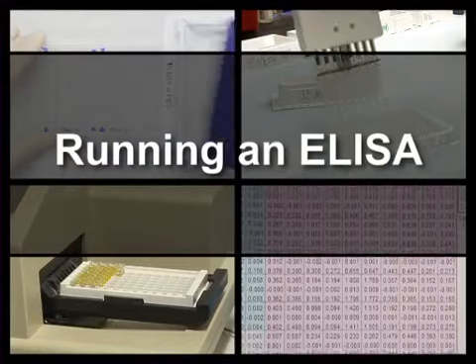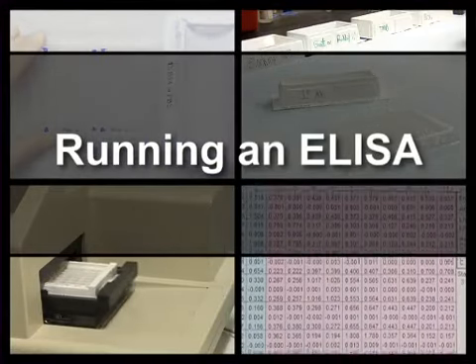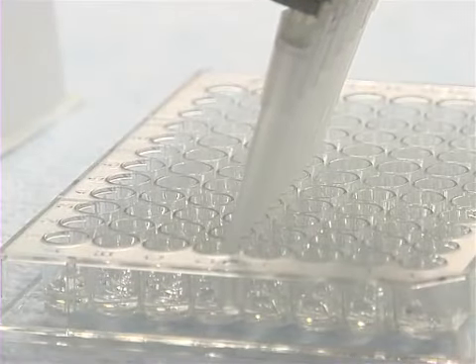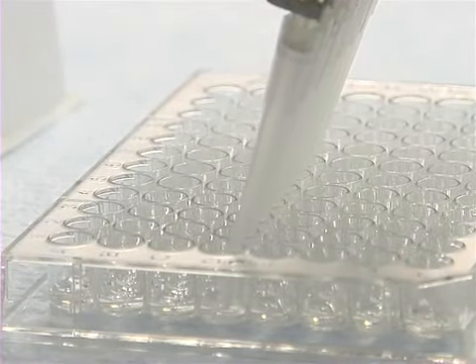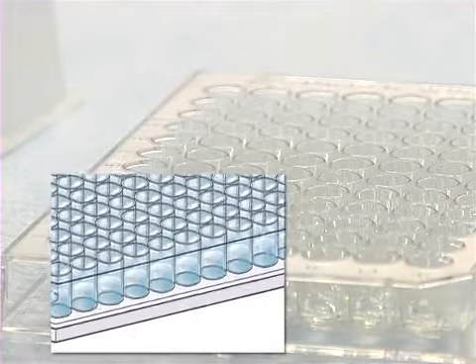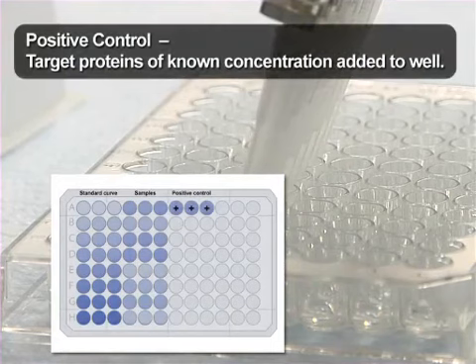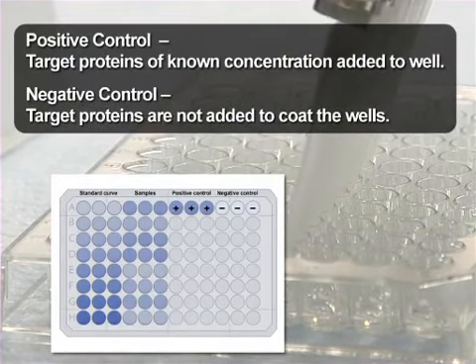Now that you have all your equipment ready, let's run an ELISA. To perform a standard or direct ELISA, first coat the wells of the 96-well plate with your target protein of interest diluted in coating buffer. Plate your positive and negative controls at this time as well.